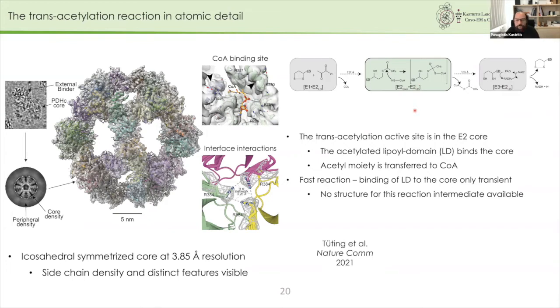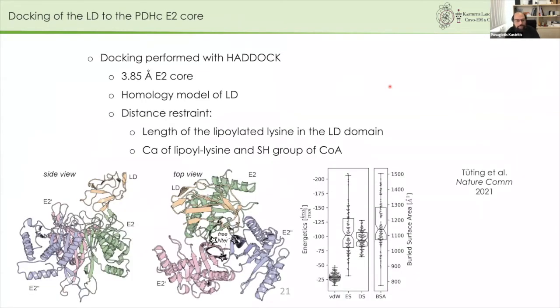And we wanted to see specifically these interactions in the active sites inside our core. What we did is something very simple. Back then, less than 1 year ago actually, we modeled with homology modeling the domain which carries the lipoyl lysine, which inserts inside the active site of the E2.